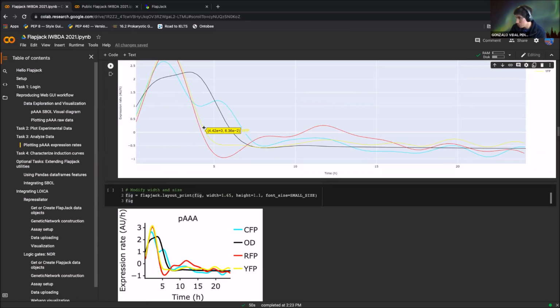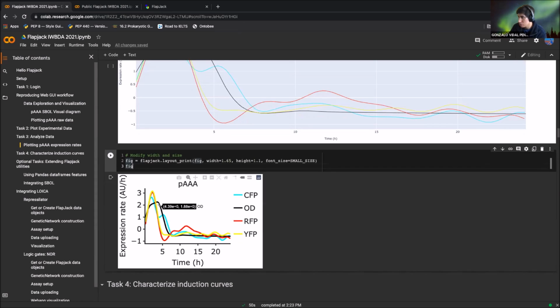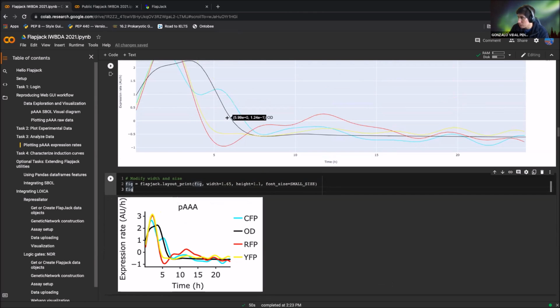As well as this plot, and as Carlos showed, we can make a print layout of this, and it's basically like this. So this is an easy to print layout for your figures if you want to use them in a paper. This is one format that we said would be good for publications. So it's easy to make figures, to analyze them, and easy to make figures for the publication.